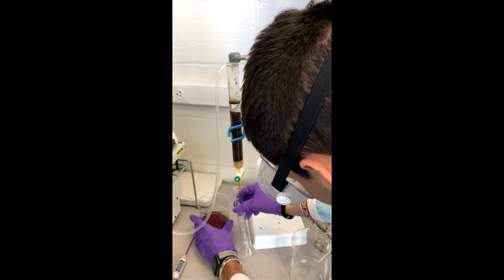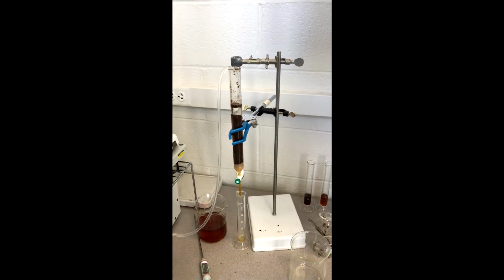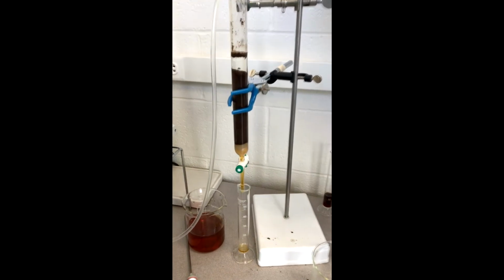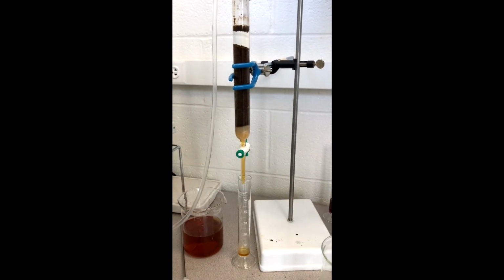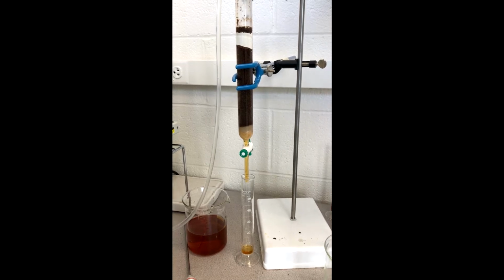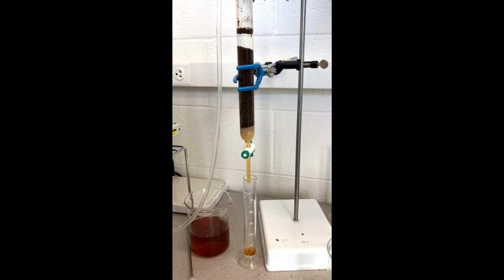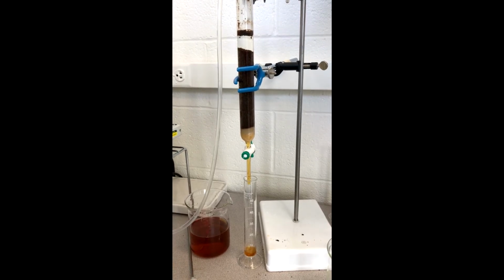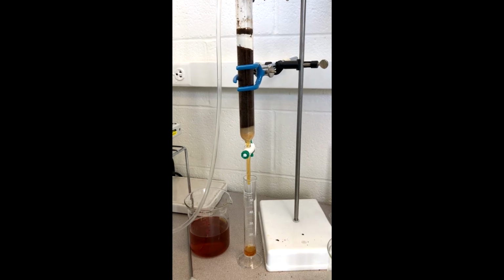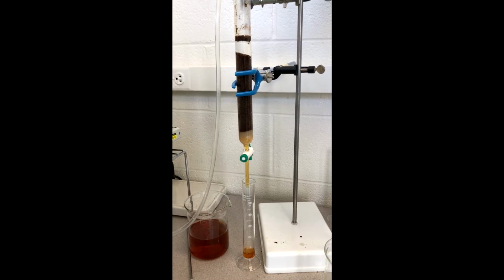For the solid liquid extraction portion of this lab, you're going to start off with the packed column that we just talked about, and you are going to set the flow rate of your system so that the column is at steady state. You're then going to want to insert a graduated cylinder below the column, which will catch all of the water that has the extracted caffeine in it and allow it to fill up to 15 milliliters before swapping it out for another graduated cylinder and allowing that one to fill up again too for however many trials you'd like to do. In our case, we did 3.